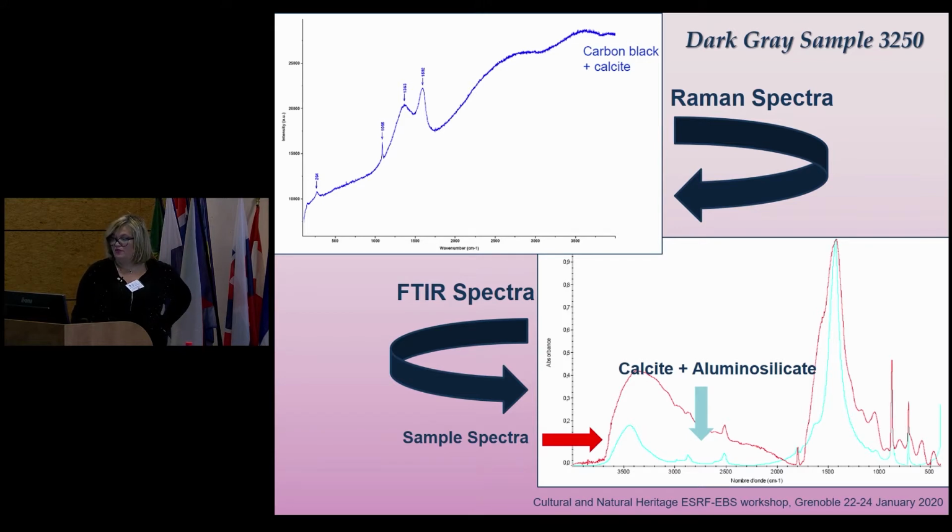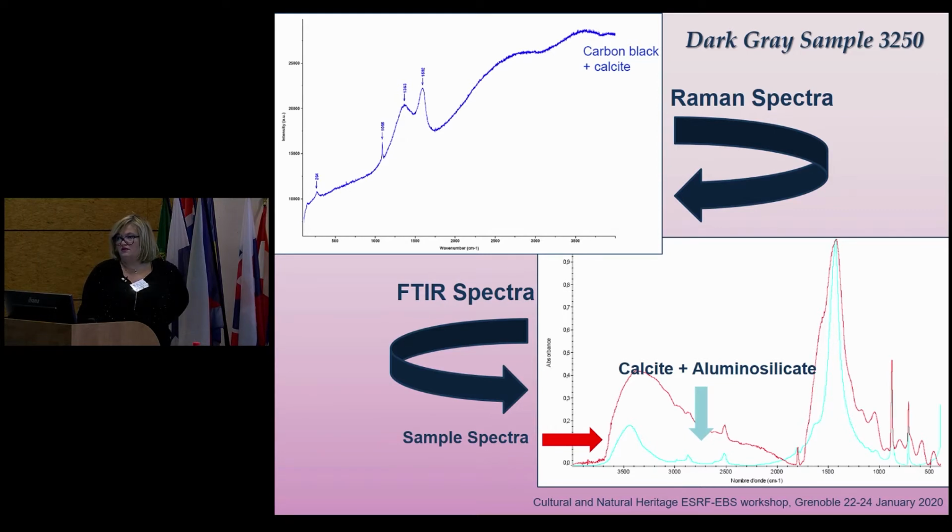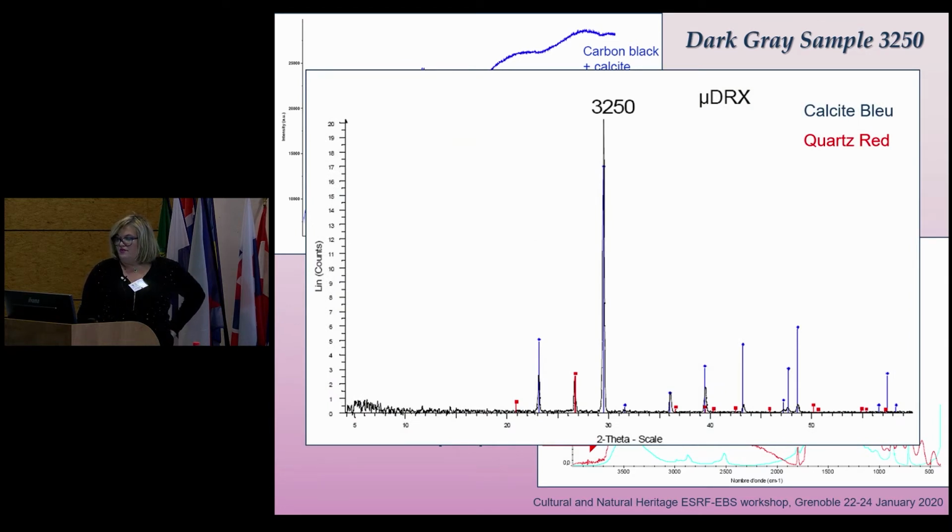And these are just two examples of Raman and FTIR spectra. We study powders, inorganics, quite simple. What we also study in other samples is quite difficult, so we study the shoulders, and we assign each band to a ligand in vibrational spectroscopy. So usually we also make the assignment of all the bands. We do also X-ray diffraction, powder diffraction, but in this case the pattern was not so good, so we had to come to a high resolution beamline to have all the patterns with a good result.